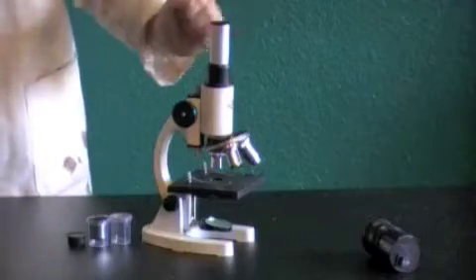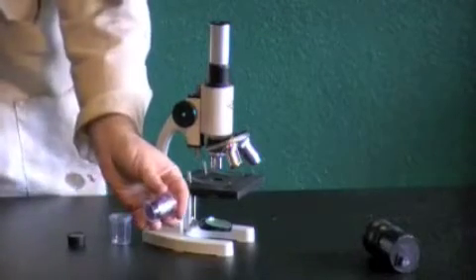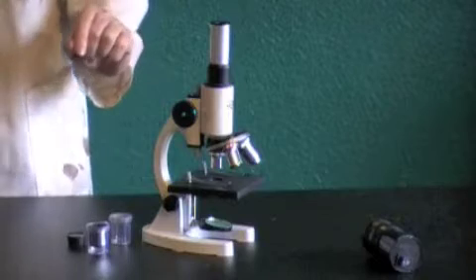So this is your ocular lens. We put the 10x ocular lens. You also have a 15x ocular lens. These are going to be this one. The 15x is obviously slightly more powerful than the 10x.